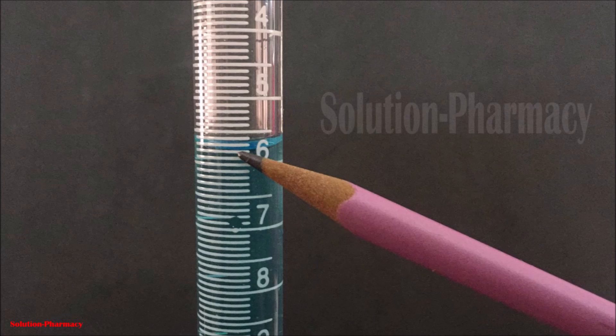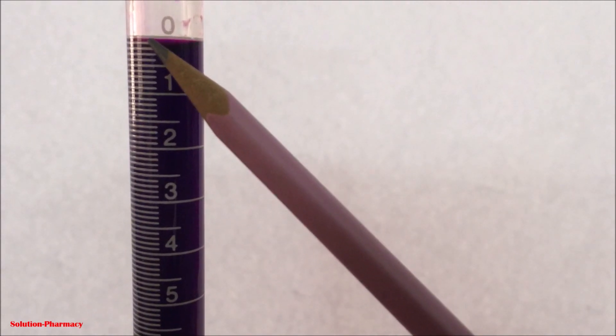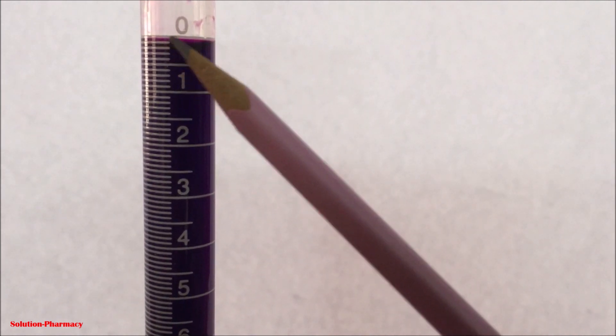To demonstrate this, next we have taken a solution of potassium permanganate. Here you can see the color of the solution is so dark that the lower meniscus of the liquid is not visible. So in this case we have to take the reading of the upper meniscus.